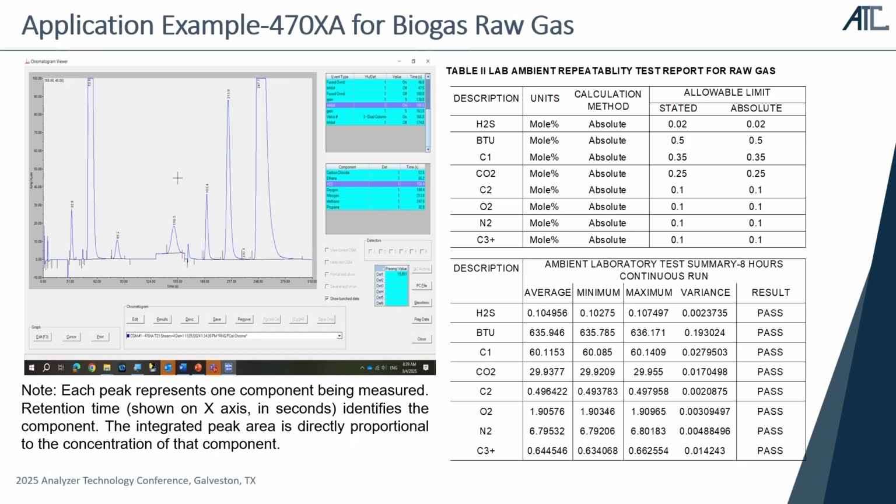The way to determine the concentration of each component is the area under the peak. It is integrated mathematically by the software. But of course, we don't need to do that calculation ourselves. The GC will just spit out the result, right?